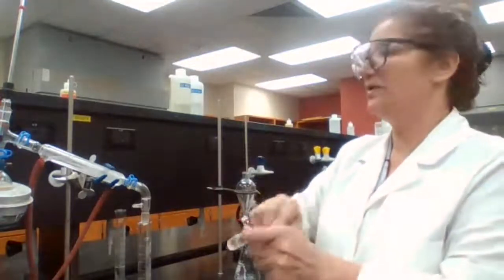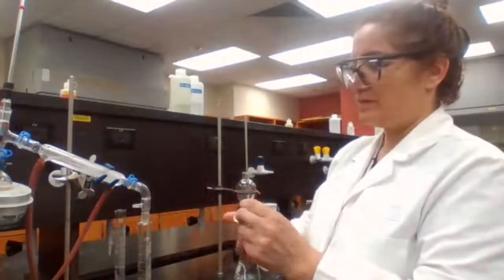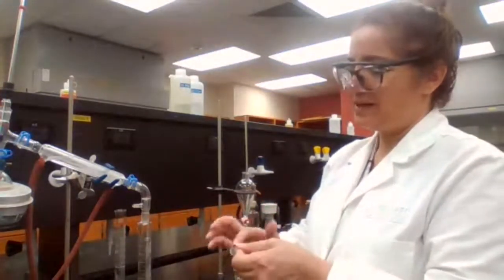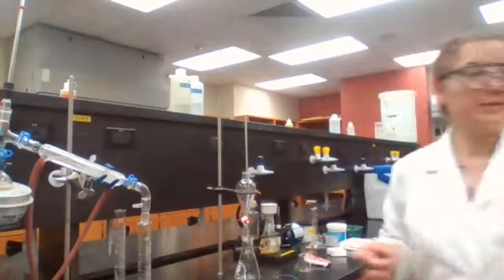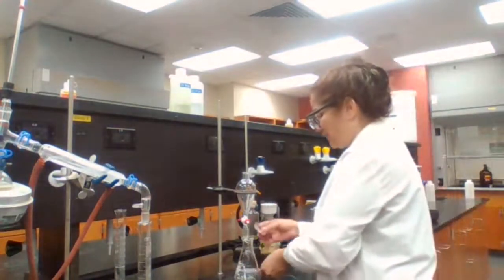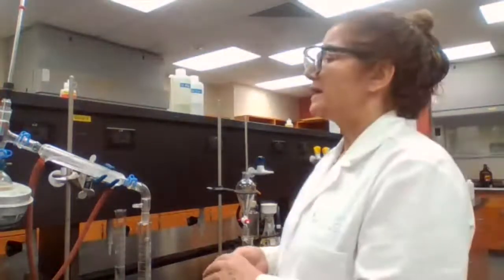This is just preparation, while we are waiting for the distillate to get to the 35. We don't have a drop yet. So we are waiting for about 30 to 35 milliliters of that. But I like to get ready for the next step, and I want to repeat that enough that hopefully you get the idea. You cannot wait until you get the 35 and then think about, okay, what's my next step? What should I do? So you go ahead and prepare your chemicals, your equipment for the next step.